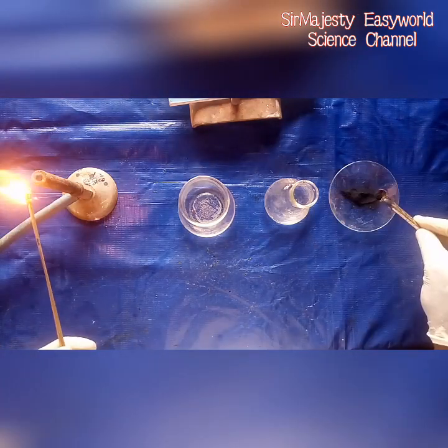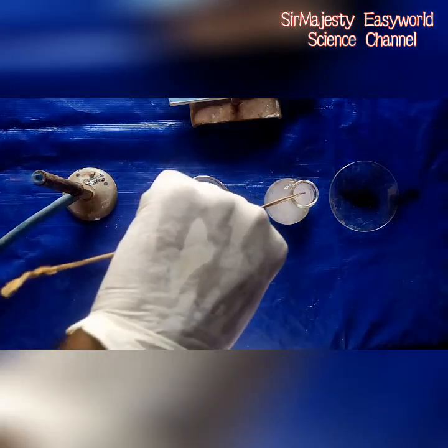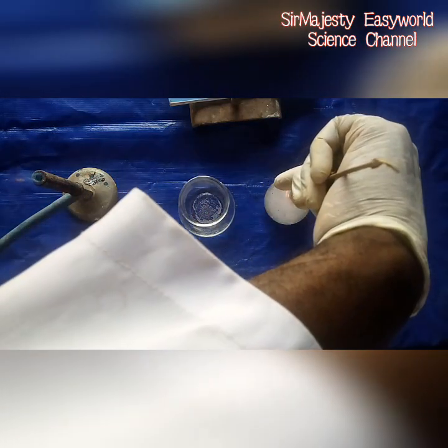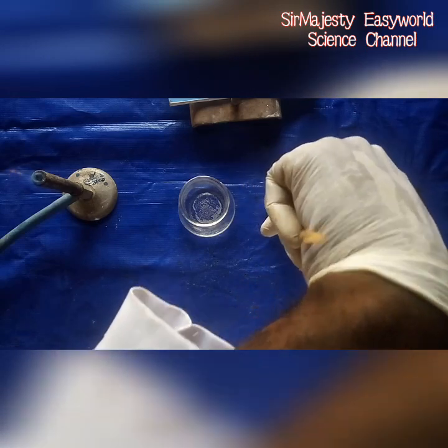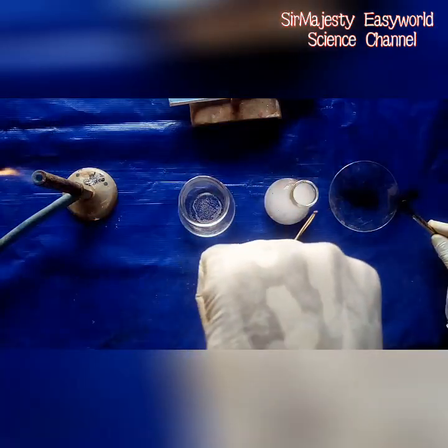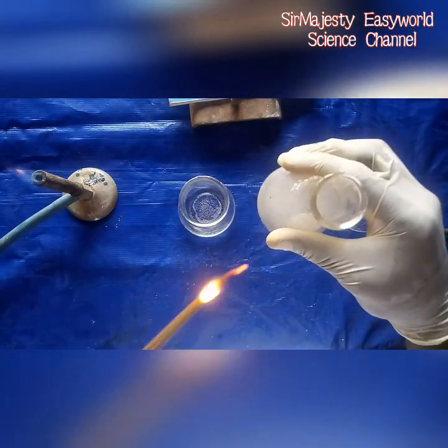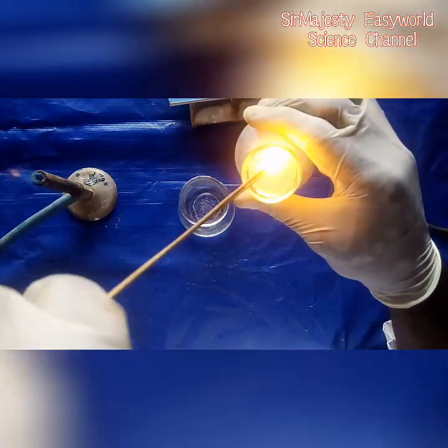We have our lighter splint ready. Now add — the gas is coming out, let's start. Wow, I see it glow! The light is on. When I extinguish it and take it back, it glows again.